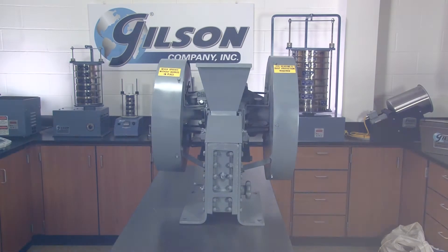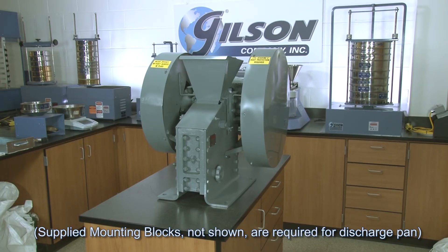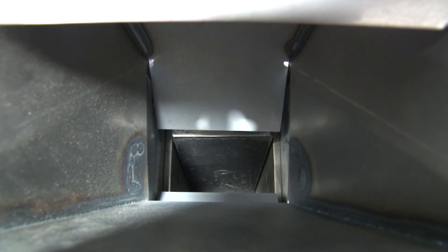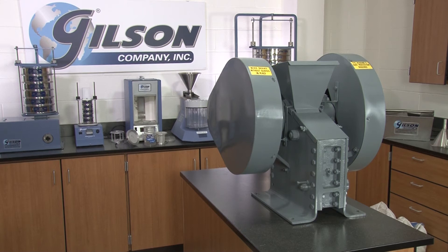The BICO standard chipmunk jaw crusher offered by Gilson has exceptional crushing capacity. The jaw crusher's resultant jaw action is a forward and downward motion relative to the stationary jaw that crushes the sample and forces its discharge.